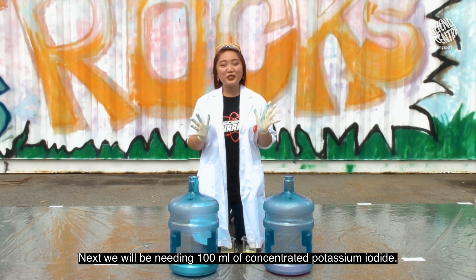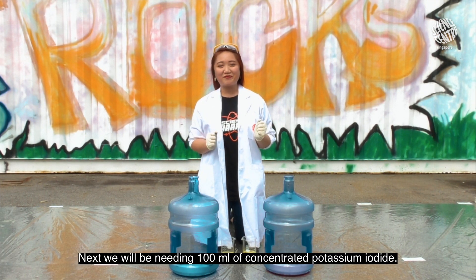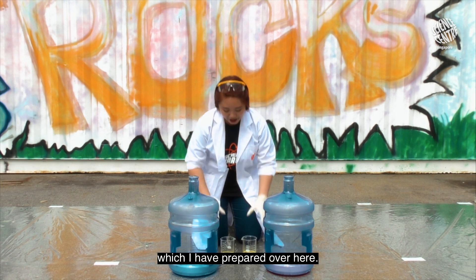Next, we will be needing 100ml of concentrated potassium iodide, which I have prepared over here.